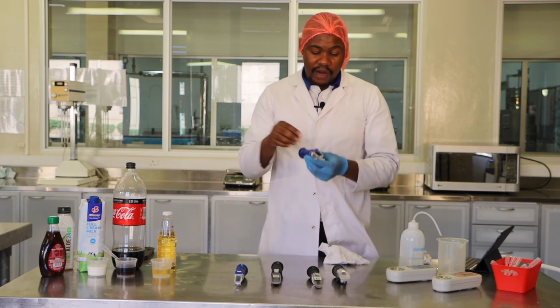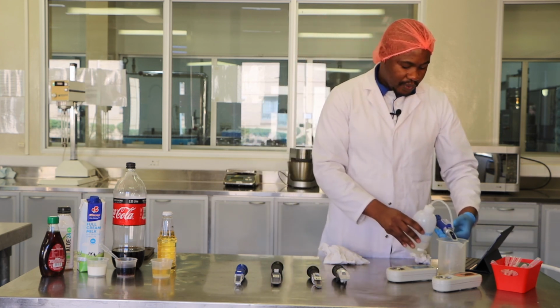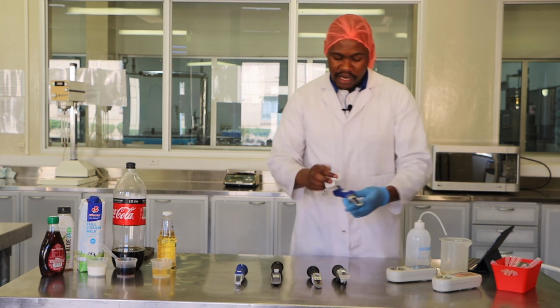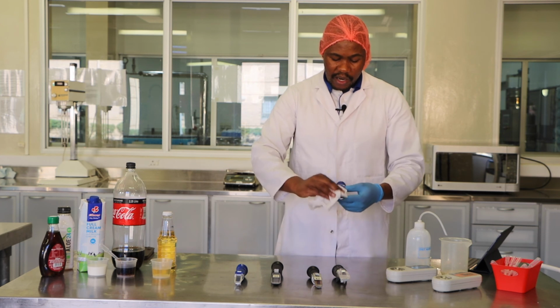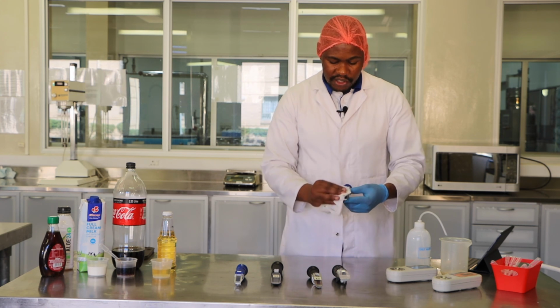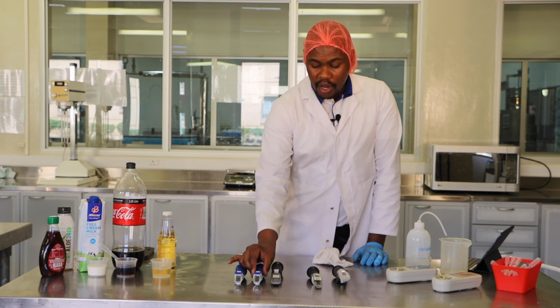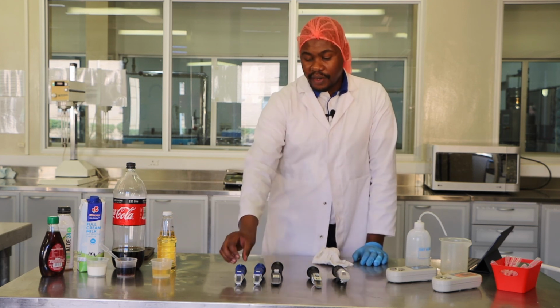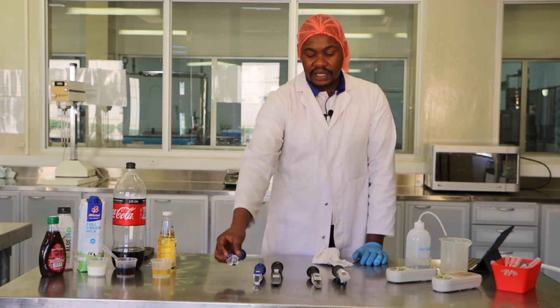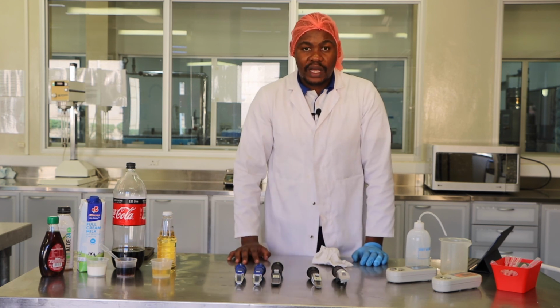When you are done with your analysis, you can rinse the prism with distilled water just to make sure that there is no sample remaining, and blot it with paper towel. Be very gentle. So this is now clean. And when we place refractometers on the table, we place them in this position. Refractometers should never be placed like this. We don't even place refractometers like this. These are expensive equipment, so we need to make sure that we take care of them.